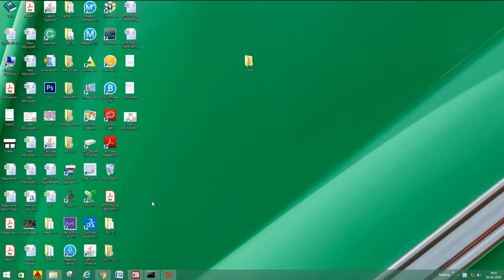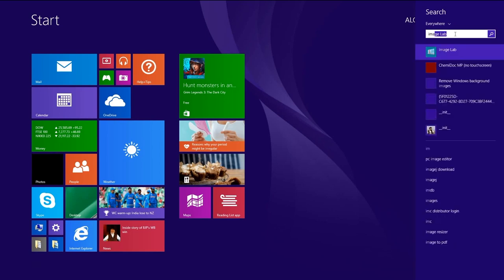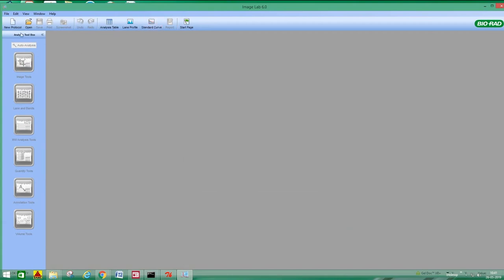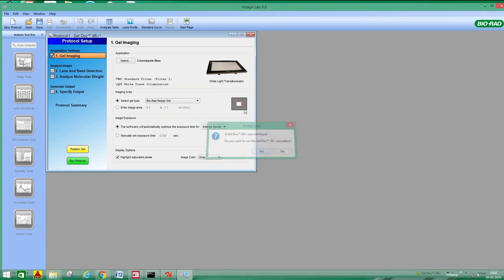In this video, we will show you how to analyze a particular band of interest from SDS or agarose gel electrophoresis gels using ImageLab software. So here I will show you how to open the ImageLab software and how to analyze different components. You have to go to start and type ImageLab. It will open, you need not do anything. We are using a new protocol, so just go on. First I will show you how to analyze the protein gels.